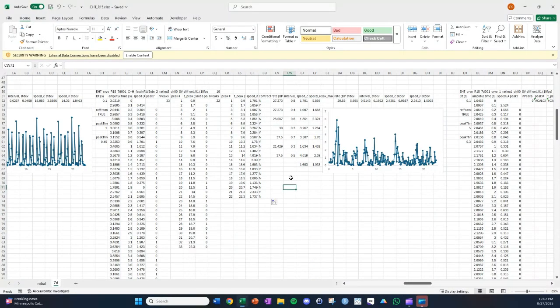This is part 2.2 of my contractility analysis procedure in tissue. Picking up to some extent where we left off here, I didn't realize I had already reached the 30-minute cutoff limit for Clipchamp, but I think it's okay. In the interim, I analyzed all the other videos and analyzed most of these peaks here. So I'll just go over the rest of this.